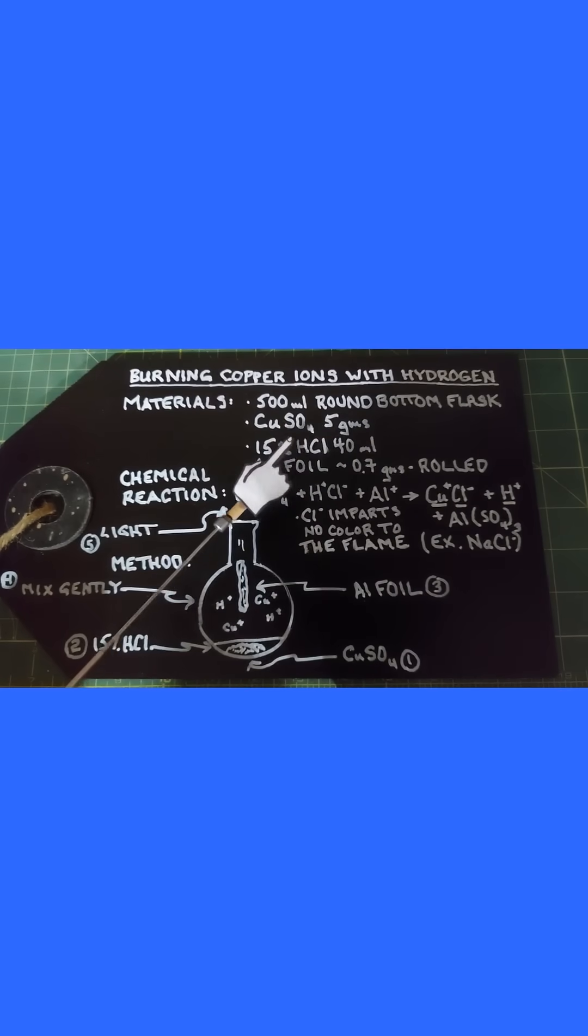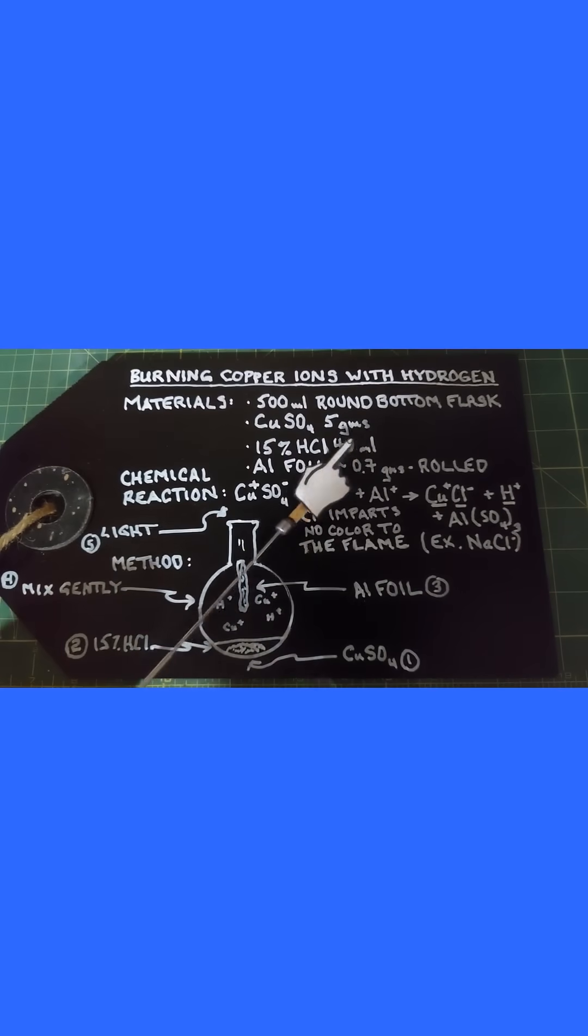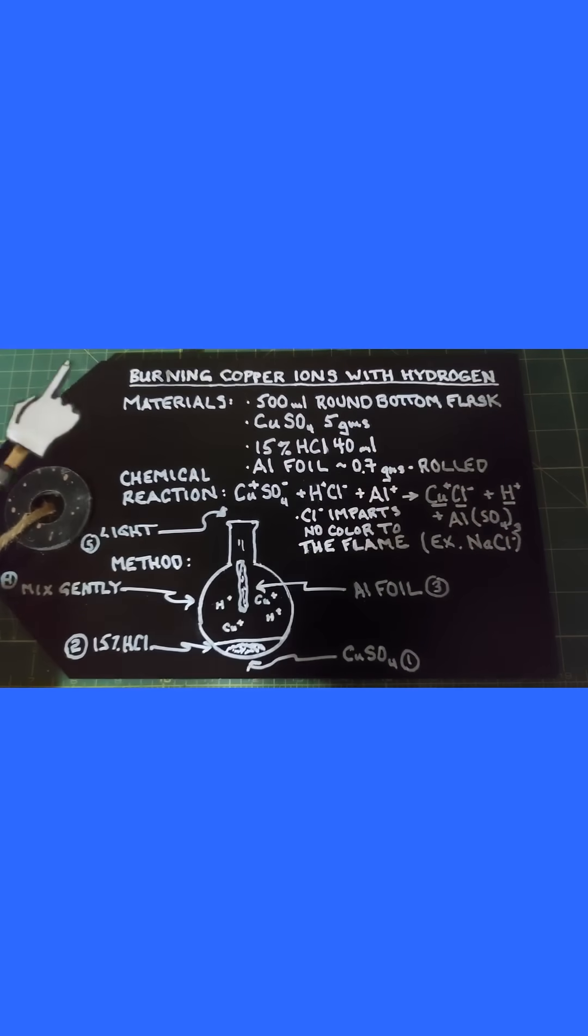We need a 15% hydrochloric acid solution, 40 milliliters, and we need some aluminum foil around 0.6 to 0.7 grams that's rolled. What I mean by rolled is like this, so you can stick it in the top of that round bottom flask.